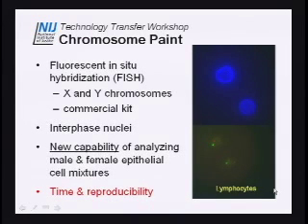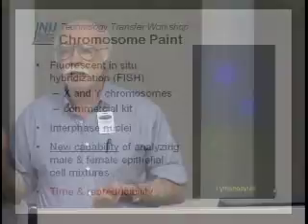And this is actually a new capability. This is something that cannot be done currently in the laboratory, but this microscope, the LMD microscope, with the fluorescence capabilities, adds this capability. This can be done. We have done it on forensic samples. You can look up there.